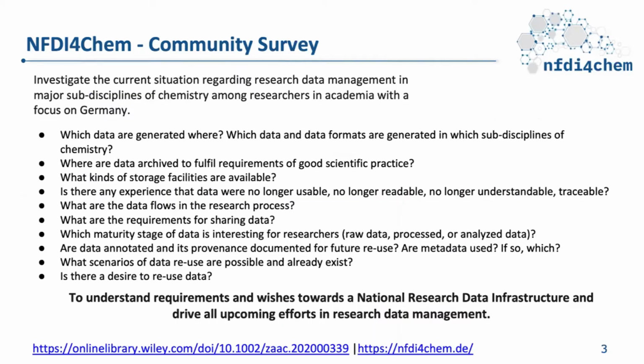NFDI for Chem. If you don't know what NFDI for Chem is, it is an initiative to build an open and FAIR infrastructure for research data management. The vision is digitalization of all the key aspects in chemical research by supporting scientists in the process of collecting, storing, processing, analyzing, disclosing, and reusing research data, especially in the domain of chemistry.